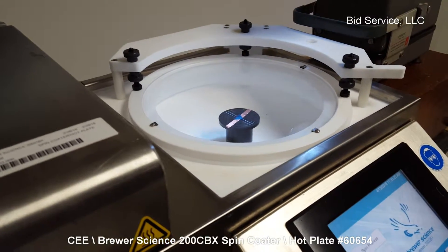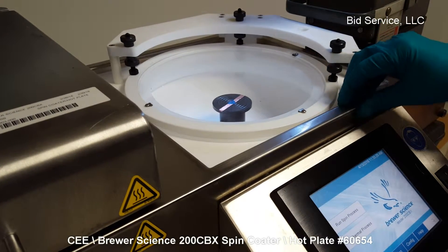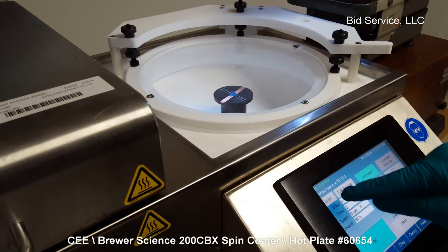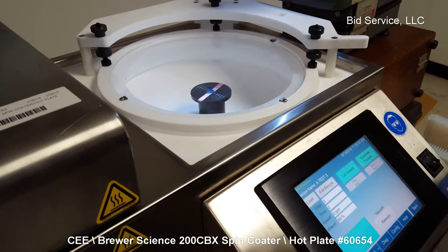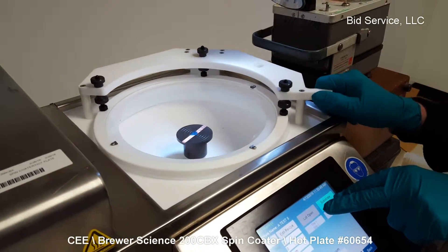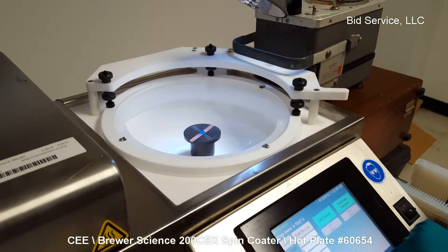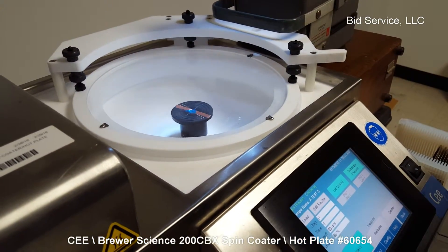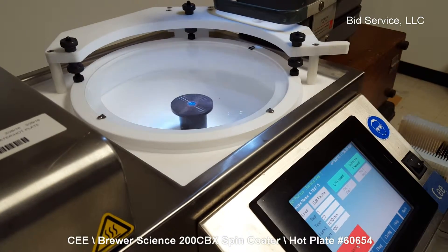In this first demonstration, I'm going to ramp up the chuck from zero up to the maximum that the machine allows, which is 12,000 RPM, and ramp back down again. An important safety feature: it will not operate if the lid is lifted up, so that's important to remember. Start process now.